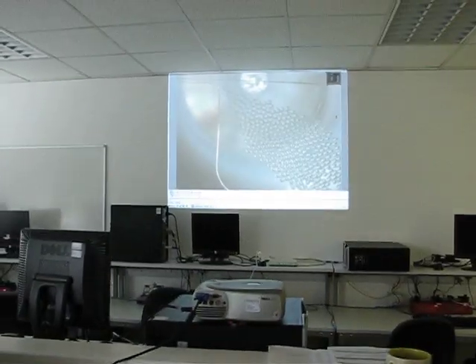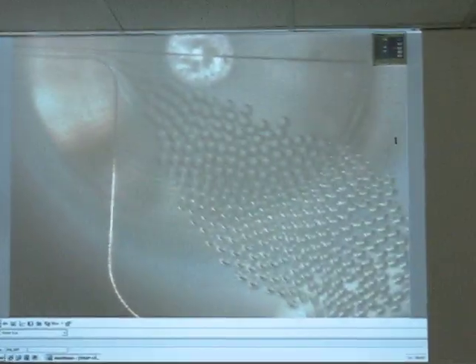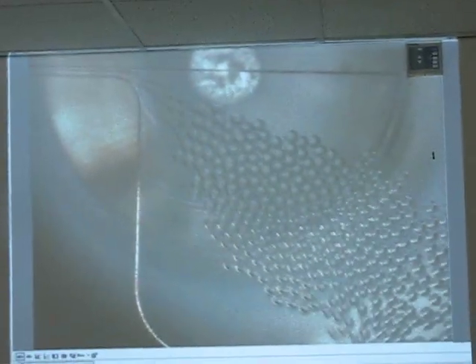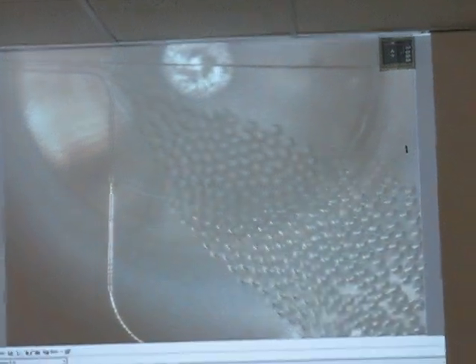And we are generating micro bubbles. As you can see on the screen, the bubbles come from the left corner. And this is actually water bubbles in the oil environment. So, let's see how we make this.